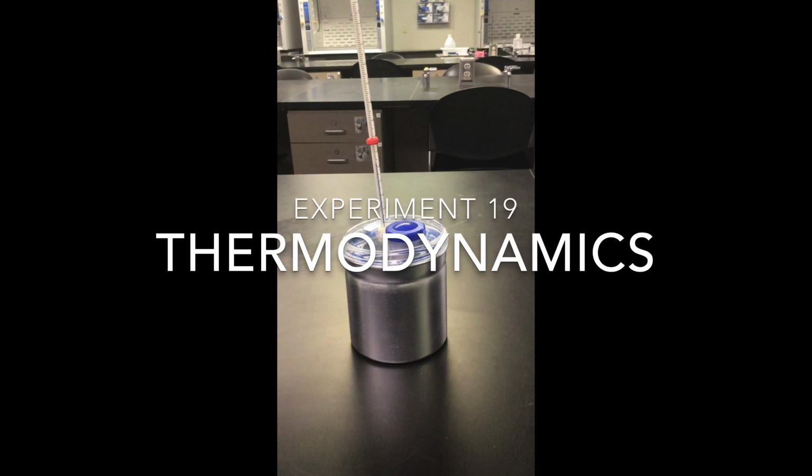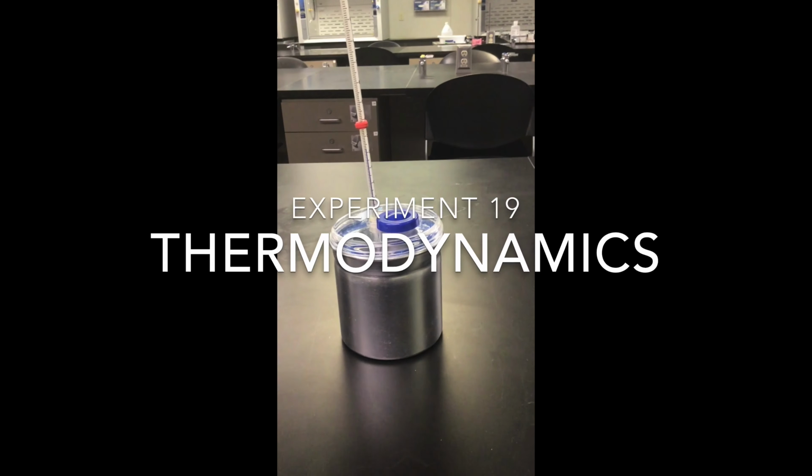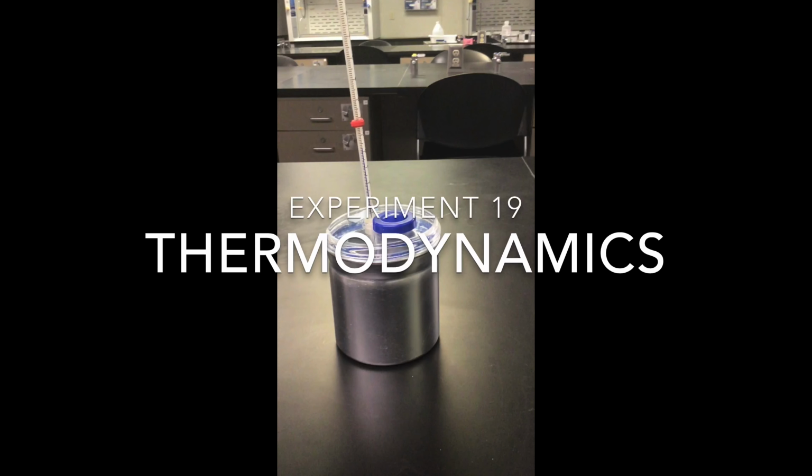Hello, ladies and gentlemen. Today, we're going to do Experiment 19, Thermodynamics.